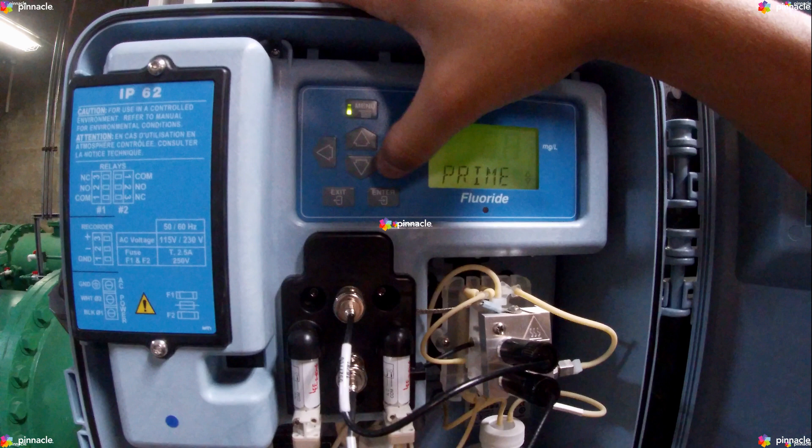The Sample option stops the current cycle and starts 90 sequential pump cycles to prime the sample line. The Standard One option stops the current cycle, primes standard one with 90 cycles, then 90 cycles of sample. The Standard Two option stops the current cycle, primes standard two with 90 cycles, then 90 cycles of the sample.